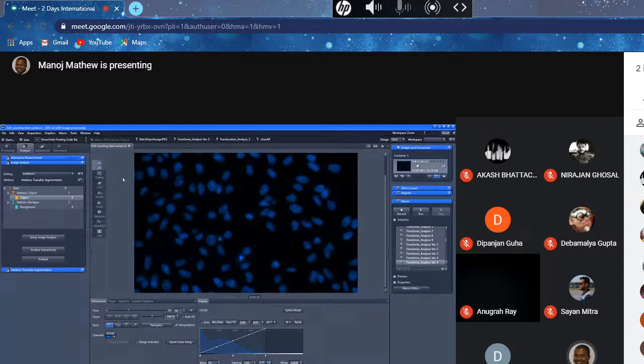So what we want to do is to save that process. Do this only once, and in this process, create a workflow. Once the workflow is created, you can do this analysis with one click every time you have a similar kind of image. So I'm going to create a workflow, and the first thing I'm going to do is give it a name. I'm going to call it Cell Analysis. Use any name. Okay, that name is already taken. I'll call it Cell Analysis 2.